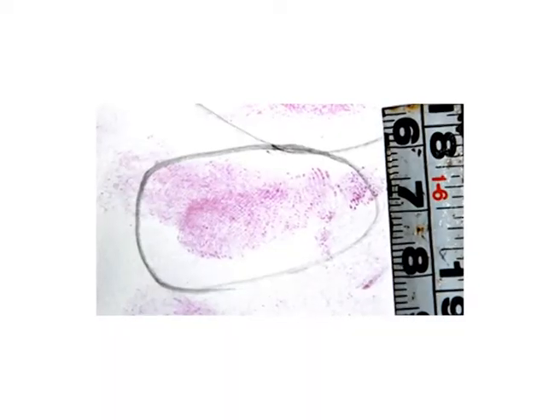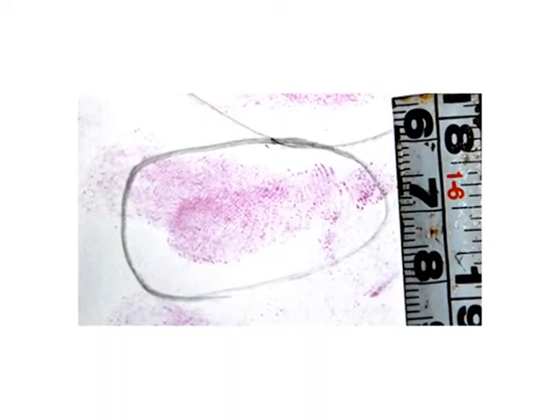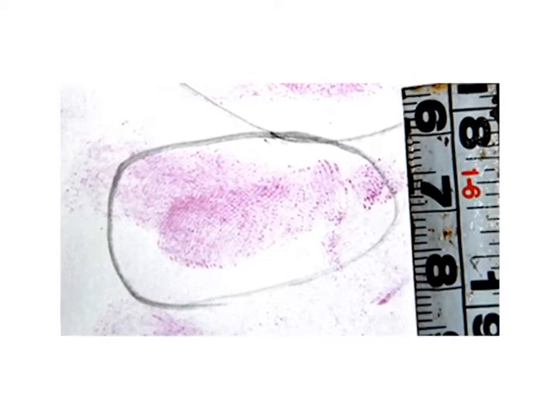The surface is then heated for a short time without allowing it to come into contact with the heat source. If quick development is not required, the item may be allowed to dry at room temperature. Better results are obtained by natural drying. A sample fingerprint developed by Ninhydrin method has been shown on your screen.